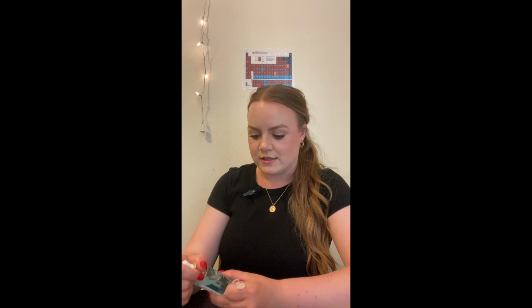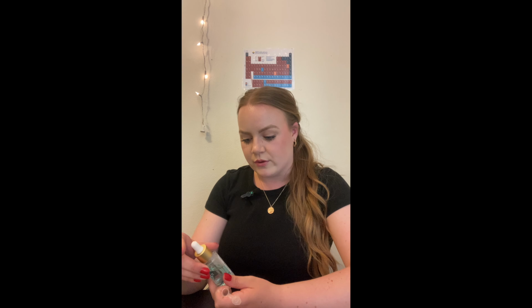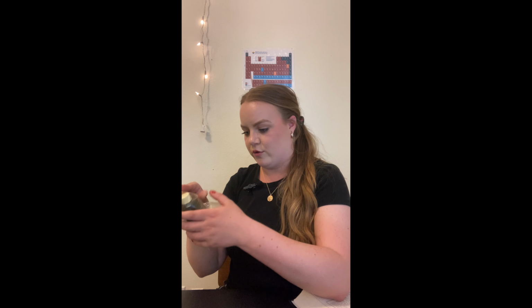My Pacifica C and C Love Vitamin C serum, and this contains 3-O-ethyl ascorbic acid. So, 25 milliliter beakers. I have the vitamin C serums I will put into the beakers with some water. I then have this 0.1 normality iodine solution. As you can tell, it leaked a little bit during shipment. You can barely make it out, and I'll open it and look at it, but it is 0.1 normality.